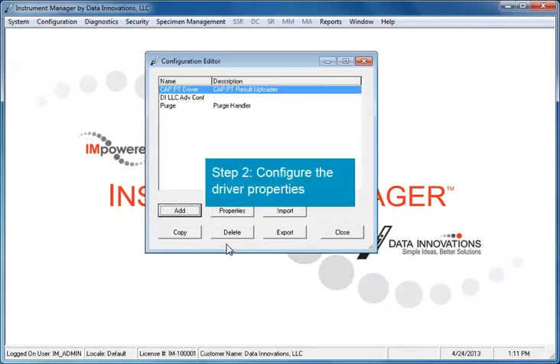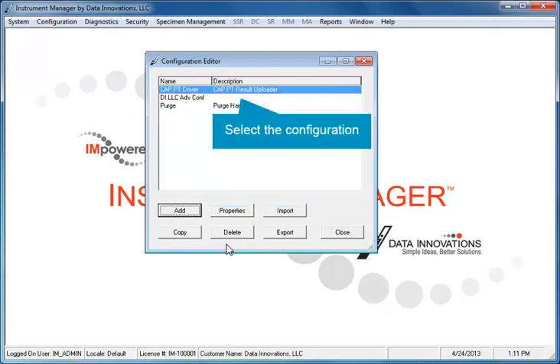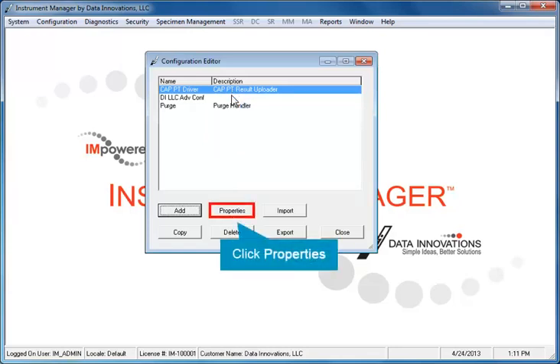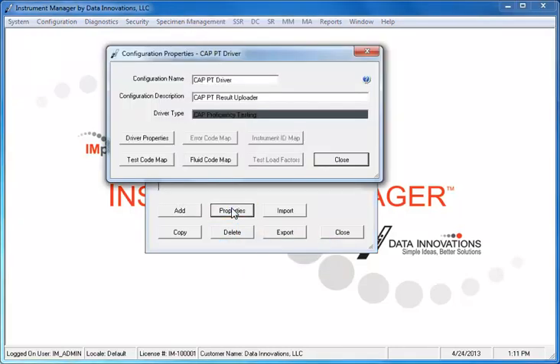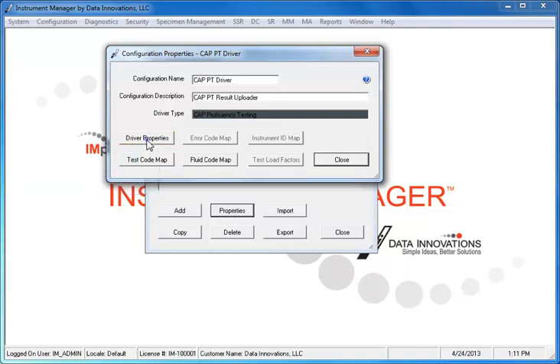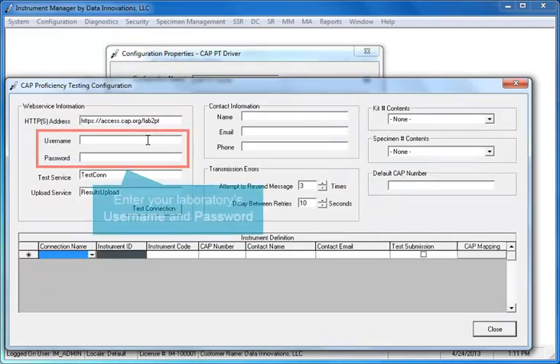Now, you must configure the driver properties. Select the appropriate configuration name in the list and click the Properties button. The Configuration Properties dialog opens. Click the Driver Properties button. The CAP proficiency testing configuration dialog opens.